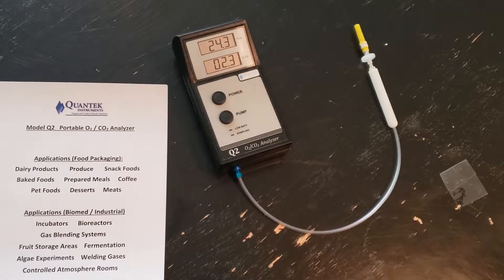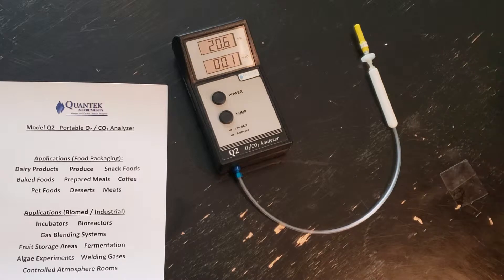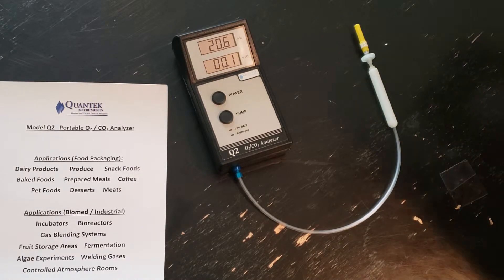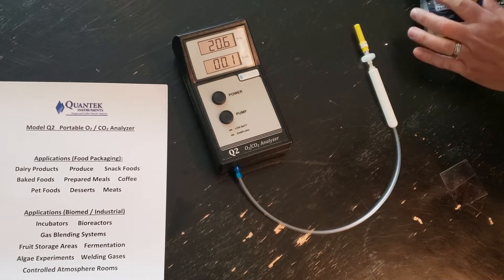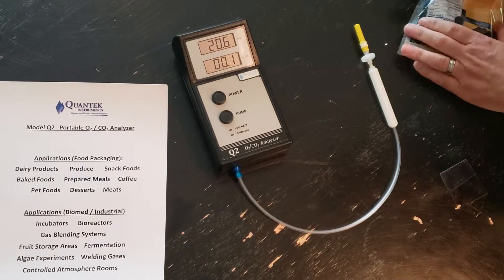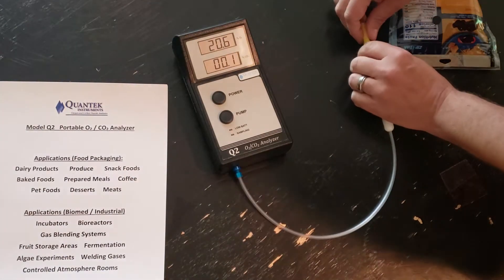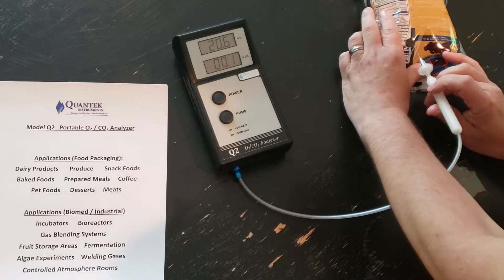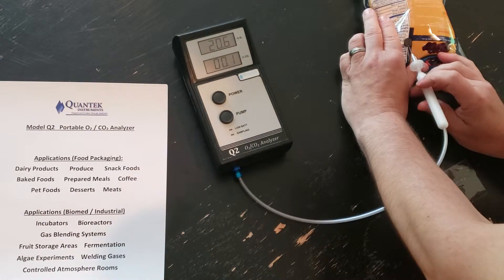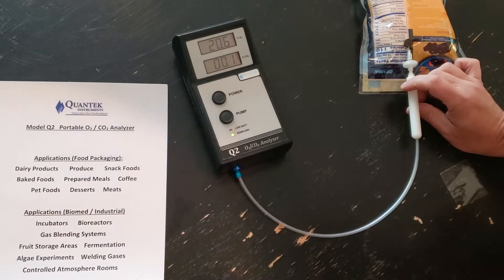We're going to power the instrument up and proceed to test a package of shredded cheese, which we would expect to have a low oxygen level and a high CO2 level. We're going to place a foam septa on the package, remove the needle protector, and place the needle in the septa — that gives us a nice good seal. Then press the pump button.